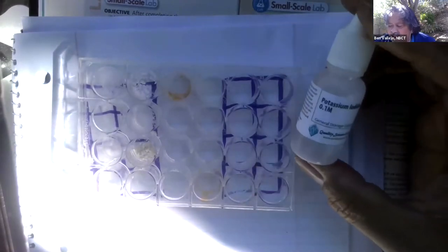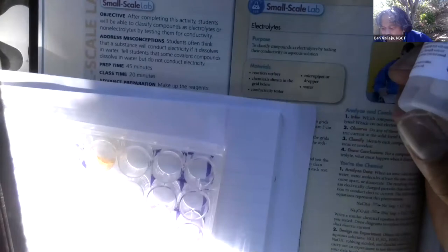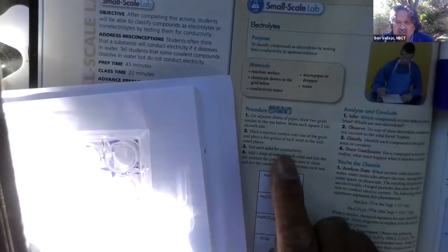Oh, here's a K. In our kit, we got a liquid KI, okay? I don't know if that's going to work. We'll see. All right, let's go to the instructions right here.